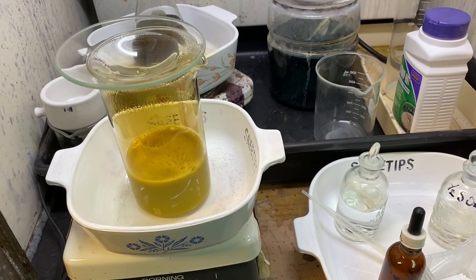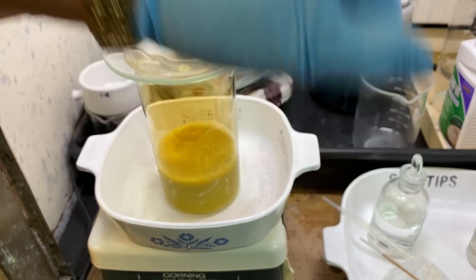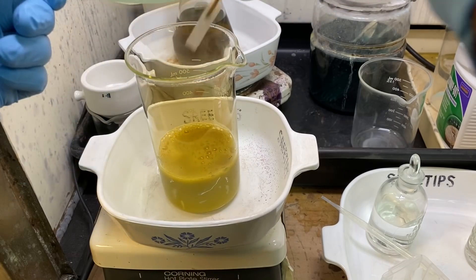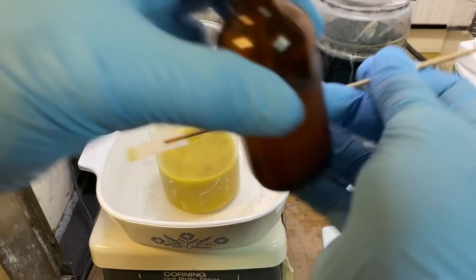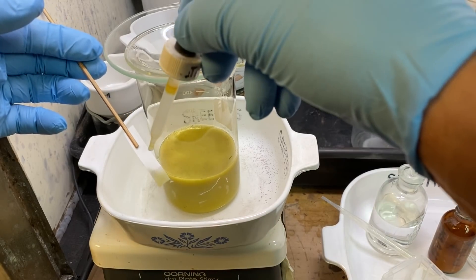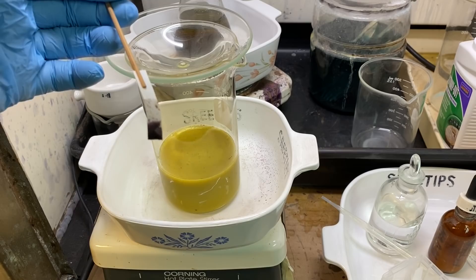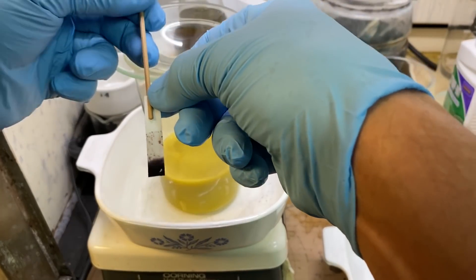It is now 1 p.m. — I started this experiment around 7:30 or 8 a.m., so it's been about five hours. I'm going to get a little bit more of our solution on a piece of filter paper and check it with some stannous chloride testing solution to see what kind of concentration we're looking at. That's a nice dark stain — quite a bit more gold in solution.